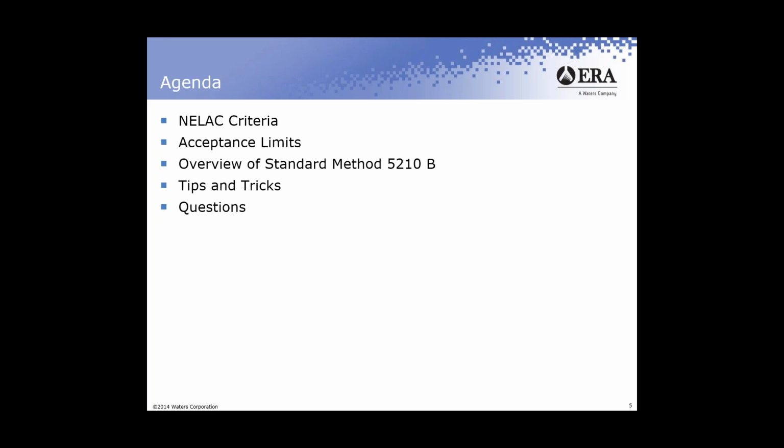These factors can contribute to potential erroneous readings when testing your effluents or your field samples if you're a commercial lab. And they can cause tremendous headaches when performing proficiency testing or our PT analyses. So I know a lot of you are preparing for your DMR QA for this year, so we're going to talk an awful lot about things that can help us with that. Really knowing and monitoring what I call these pitfalls in BOD analyses and having a good understanding of the proficiency testing criteria can really dramatically increase the reliability of your BOD test results. So that's what we're going to discuss today.